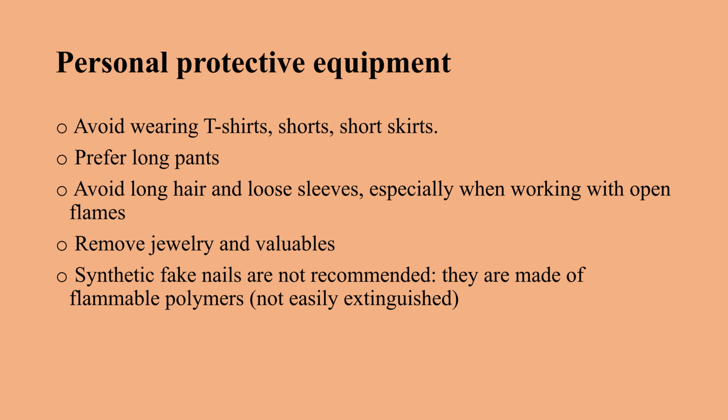Of course, it's a different type of clothes, but in the lab T-shirts and short skirts are not appreciated. Long pants and a lab coat are approved. We should keep long hair tied back, because we may work with strong chemicals or open flame.